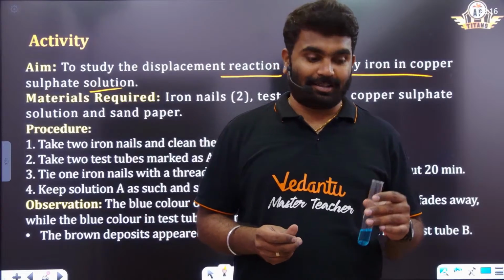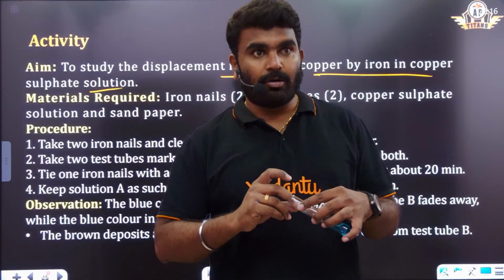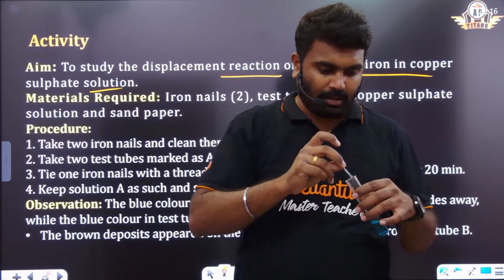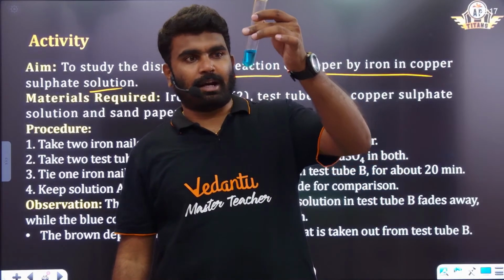Talk in Telugu or English. I have to use both languages as per the requirement. So what I'm doing, beta, I'm inserting. So what I am doing is putting this in the copper sulfate. Okay, I'm inserting it in copper sulfate. So I have inserted it in copper sulfate.